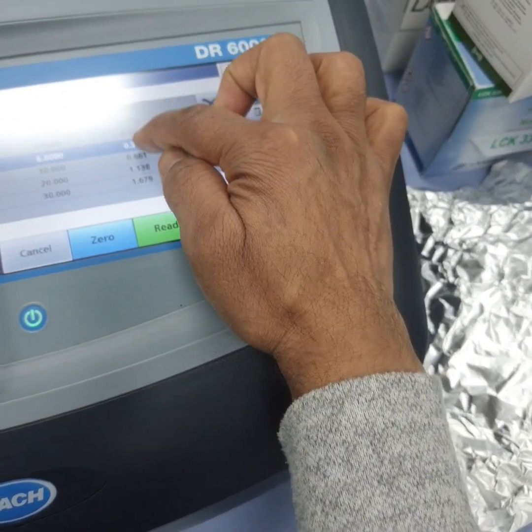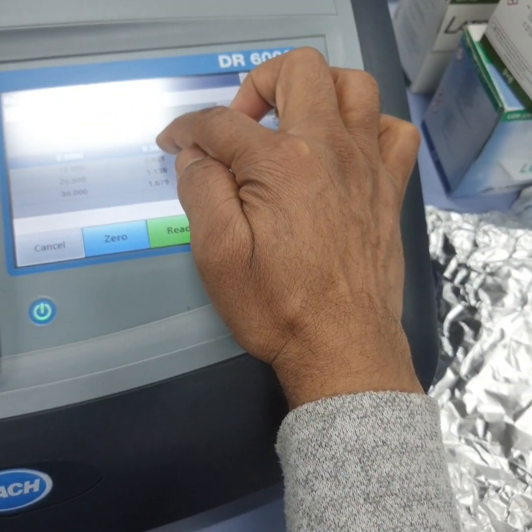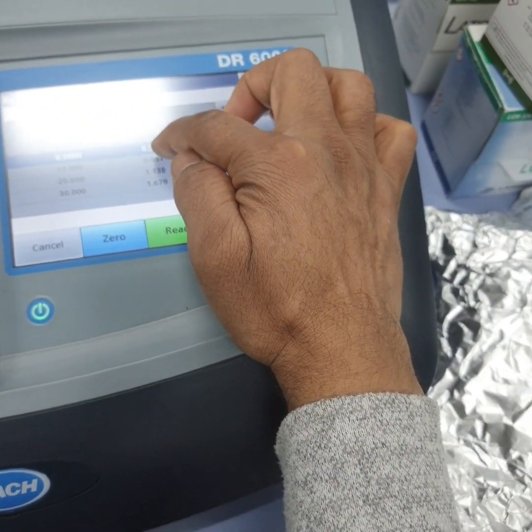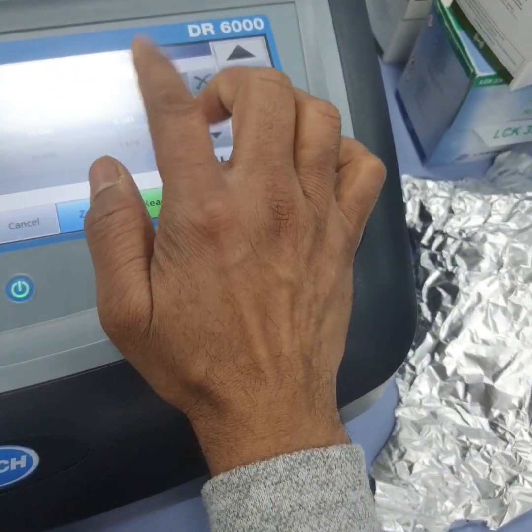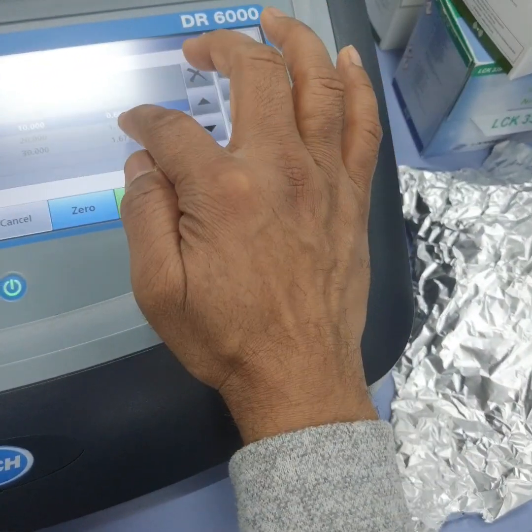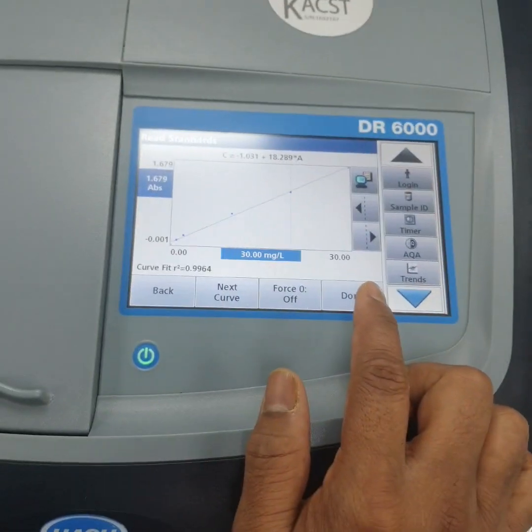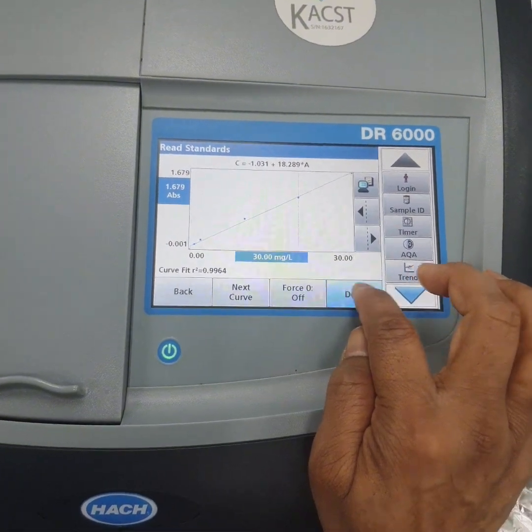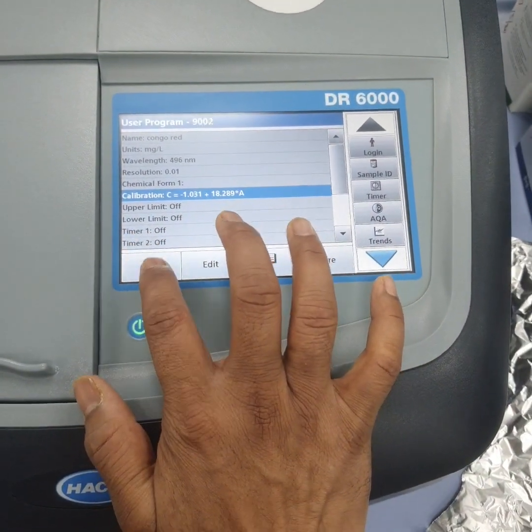And this is how much? If you compare with this one also, it should be like 3 times. 6 times from this one, right? So let's check again. It's showing correct, but we can delete. And what about this one? Even this is also not okay. But anyway, it's okay. So go and check. This is 0.9964. So done. Store. Exit, right? Now this is ready for measurement.